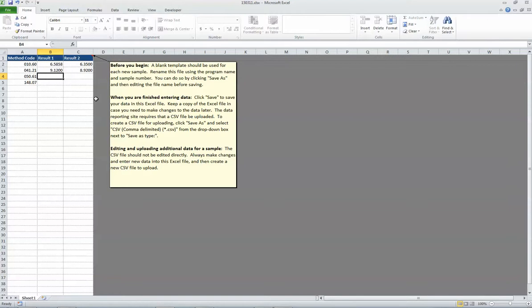Oh, and the thing, I didn't realize this until I'm just entering now, it will automatically format it to 4 decimal places. So you see that. That's what the program automatically does.